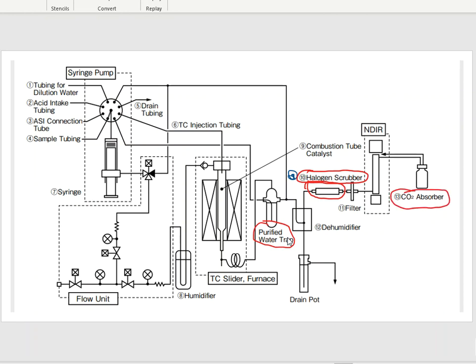And we've also not talked about something else that is not really listed in this schematic full-blown, and that's this dilution water. Where's that coming from and where's that located? So those are kind of the remaining pieces that we need to discuss. And finally, almost forgot one, this poor little filter down here at the very end. So a couple of more things that are out there.